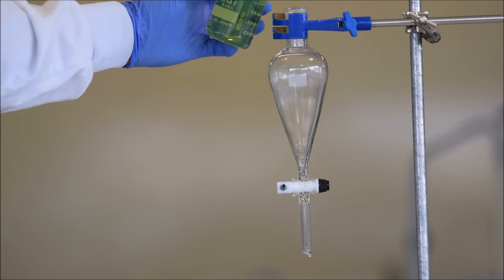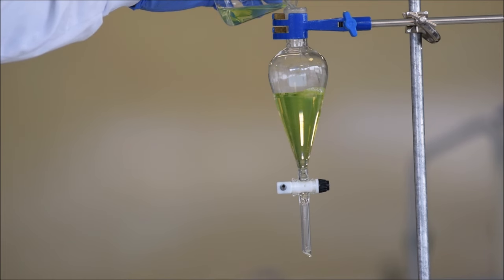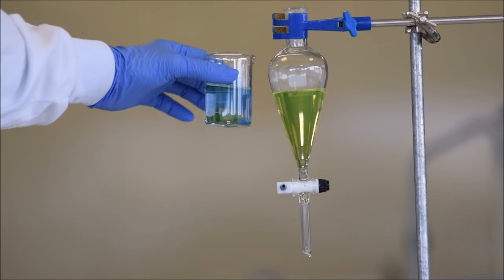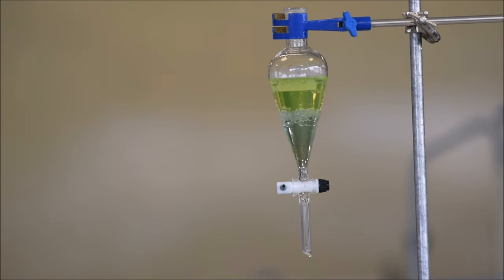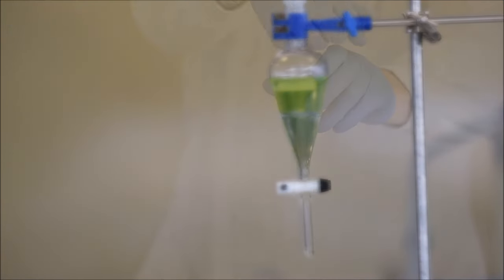If we put them into a separating funnel, we can see that dichloromethane is going to be the heavier solvent. It's going to end up down on the bottom. But also we can see that the two colours don't transfer between the layers because the nonpolar substances are happy in the nonpolar layer and the polar substances are happy in the water. So no matter how much time we spend shaking this, it's just going to stay like that. And you can watch that happen now.